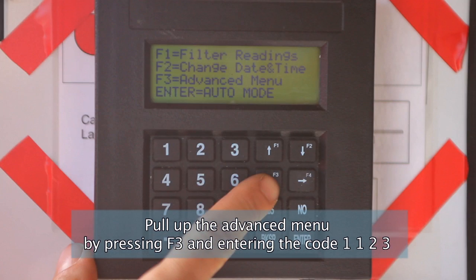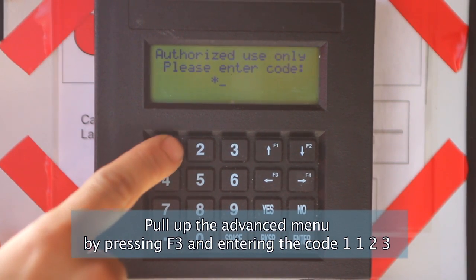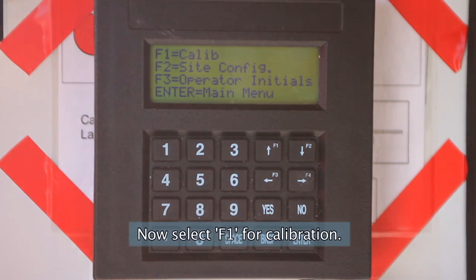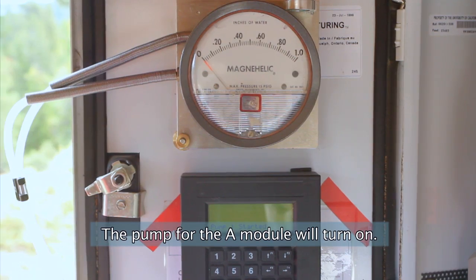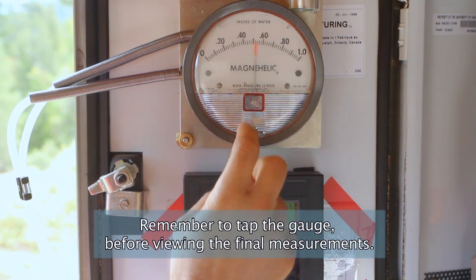Pull up the advanced menu by pressing F3 and entering the code 1123. Now select F1 for calibration. The pump for the A module will turn on. Remember to tap the gauge before viewing the final measurements.